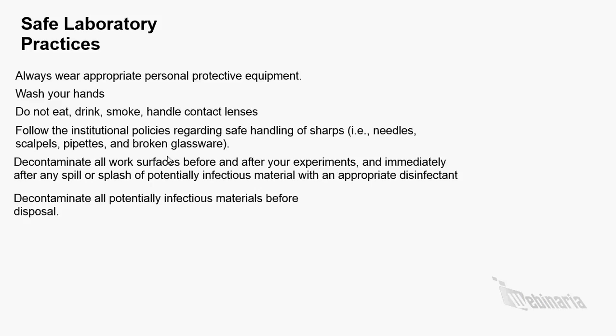Decontaminate all work surfaces before and after your experiments, and immediately after any spills or splash of potentially infectious material, with an appropriate disinfectant. Clean laboratory equipment routinely, even if it is not contaminated. And finally, decontaminate all potentially infectious material before disposal. Don't just pack it up and send it to the trash.